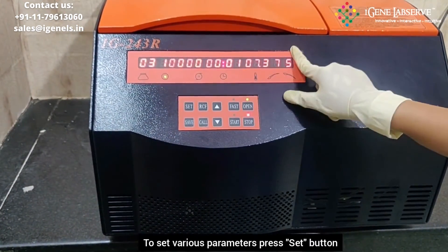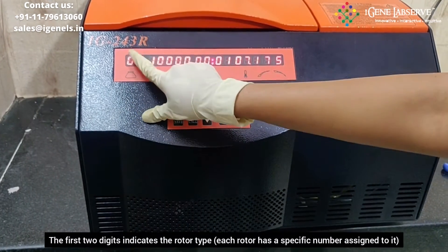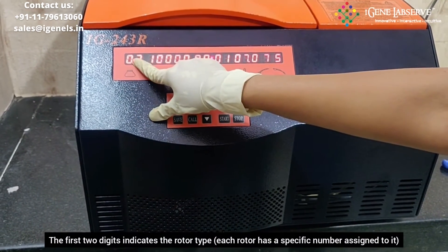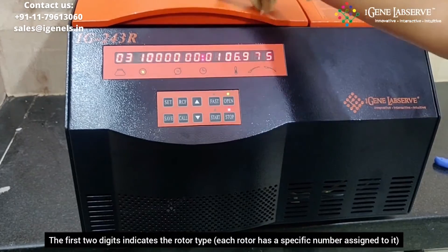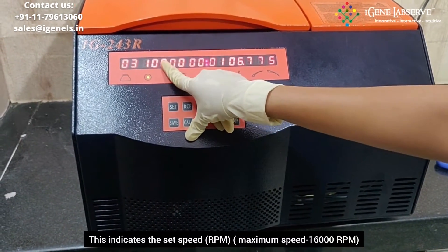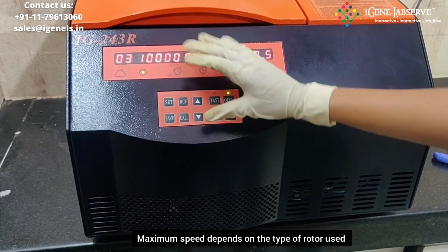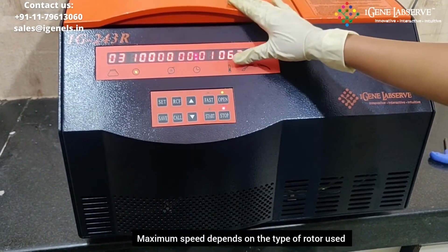To set the various parameters, you have to press the set button. This is the rotor number — for different types of rotors, there is a rotor number which is written on the rotor. This is the RPM; it can set a maximum RPM of 16,000, but the RPM depends on the type of rotor that you are using.